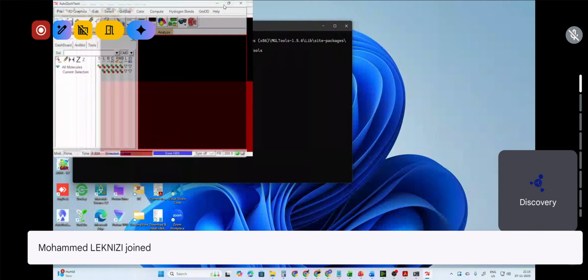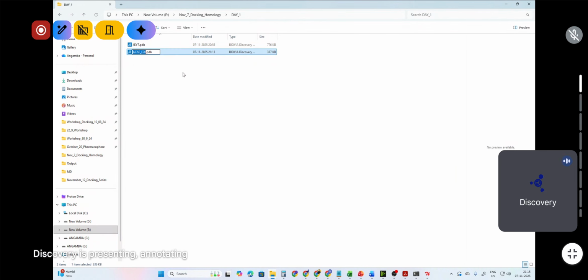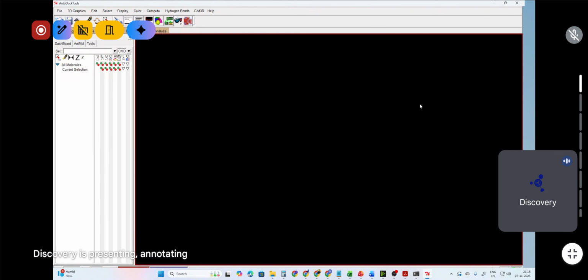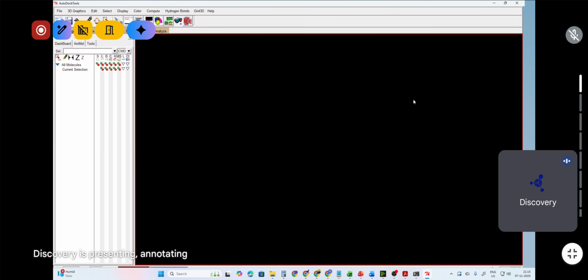If you do not save this file or checkpoint, you have to start from scratch again and delete all those things. So it's better to keep saving checkpoints; if the software crashes, you can come back to the steps where you left off.